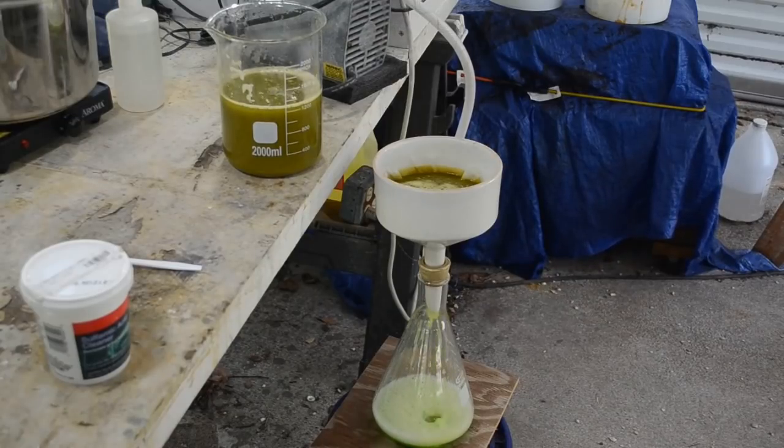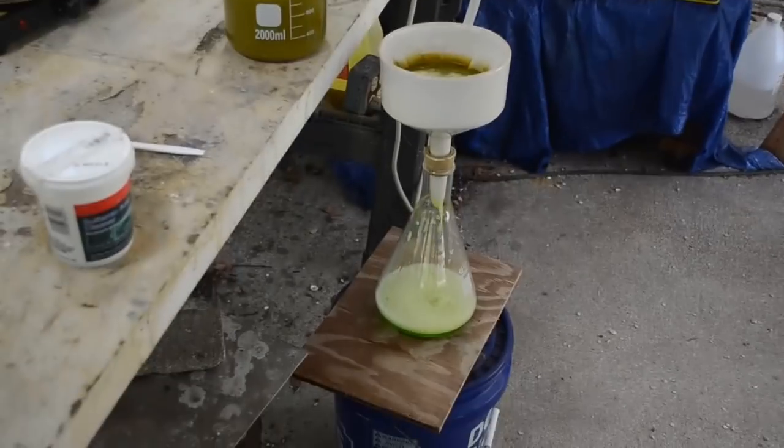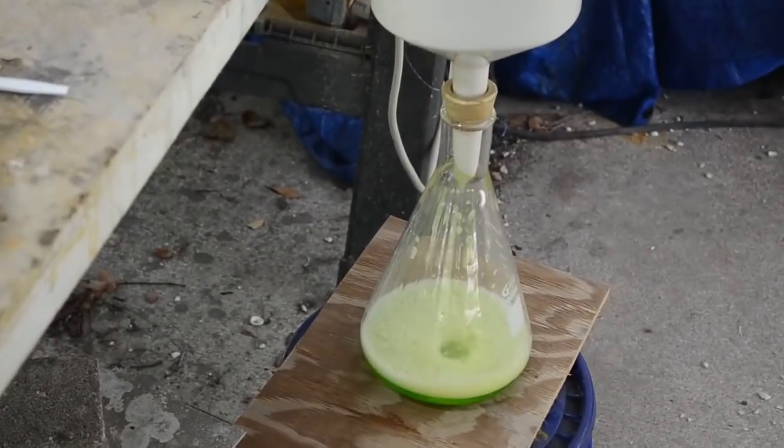All right, well, I'll just continue to filter this. This is gonna take a while. You don't have to watch it all. Be back when it's done. Oh, isn't the liquid green too down there? Oh my. So yeah, we got some copper contamination.